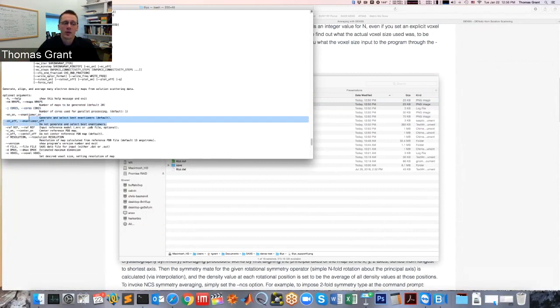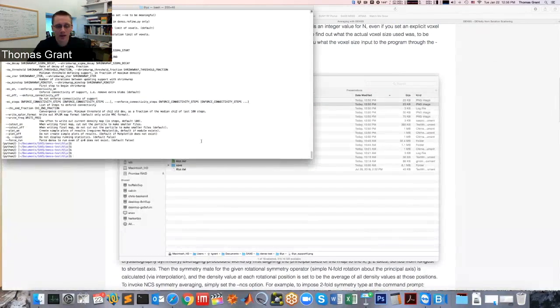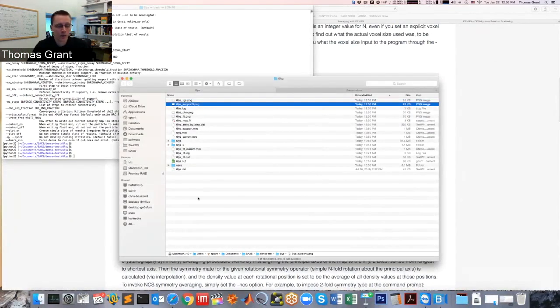And if for whatever reason you would like to, you can turn enantiomers on and off. And so you can run that. I won't run it now. It takes something in the neighborhood, depending on the number of cores you have and how you're running the system, like in terms of the parameters, of 1 to 2 hours on a good system with a lot of cores. And so don't be surprised if, on a laptop that's dual core or quad core, it takes 4 or 5 hours, particularly for the enantiomer selection. That's really what takes most of the time.